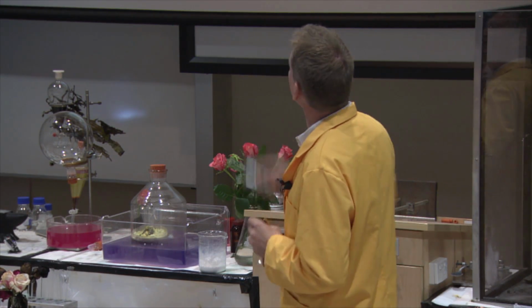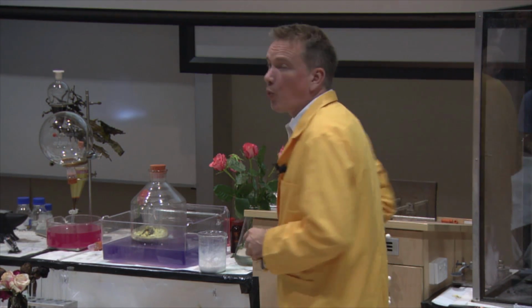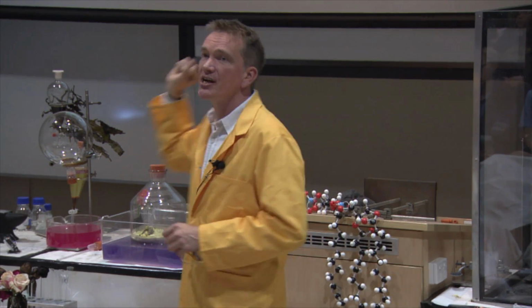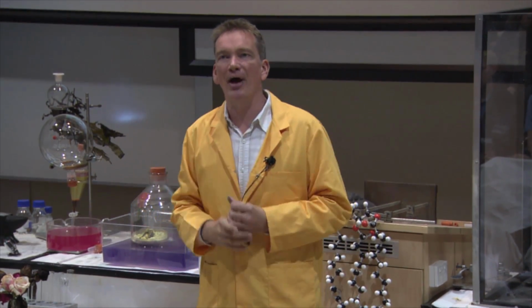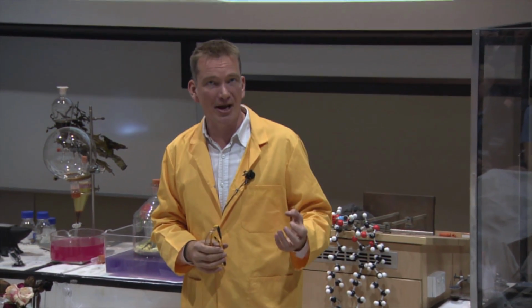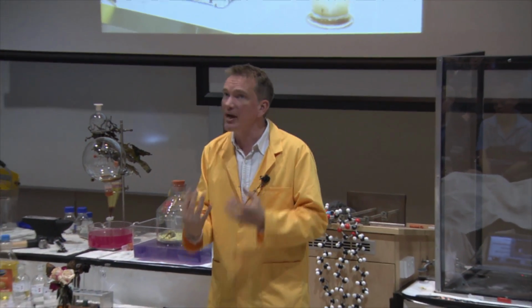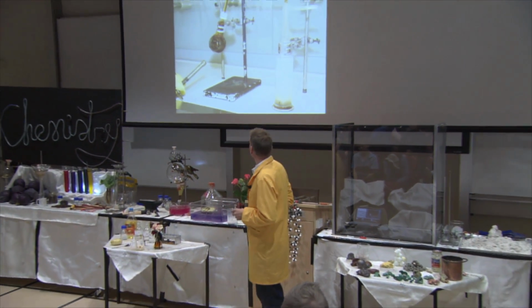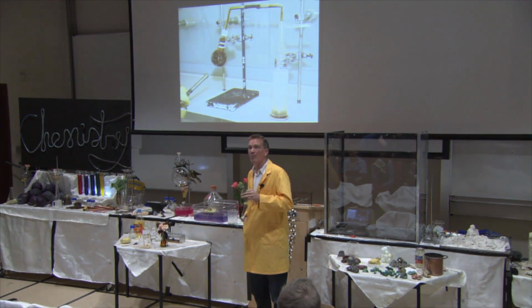And what we get, we heat up this, and remarkably, you get a nice white smoke coming off. And this white smoke contains ammonia in a compound. This is ammonium carbonate. So we've broken down the complex organic structures, and we've ended up with a very simple inorganic structure. This is ammonium carbonate.